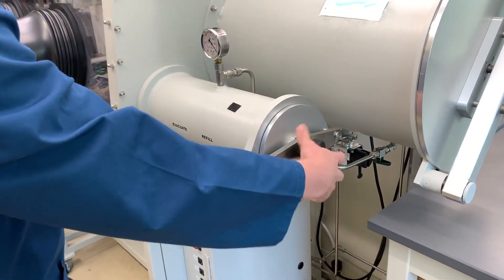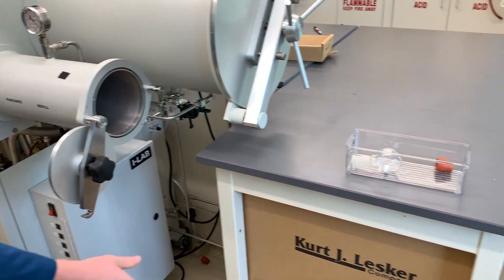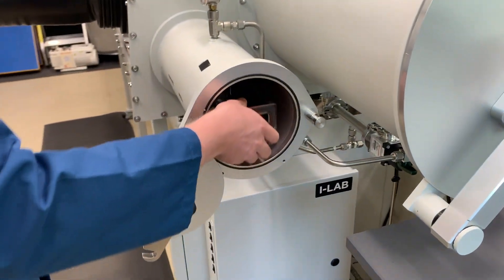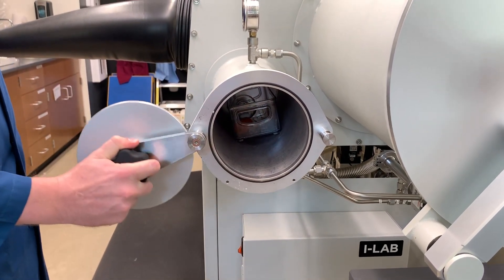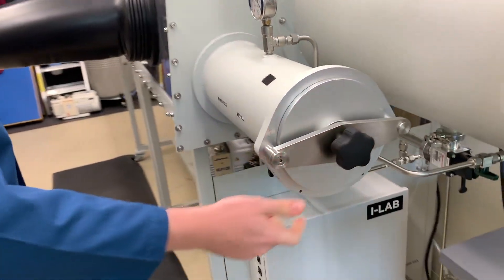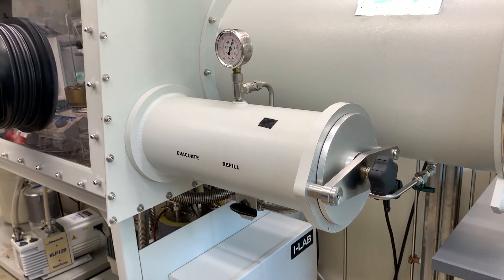Let's assume you're bringing something into the glove box from the outside. Turn the doorknob counterclockwise about a full turn until the door can be lifted up off its support post. Let the door hang while you place your stuff inside. With your stuff inside, swing the door back onto the support post, turn the doorknob until you feel that it's firm but not too tight, and then start with your first evacuation cycle. Each evacuation cycle will be five minutes, so set a timer and find something else to do.